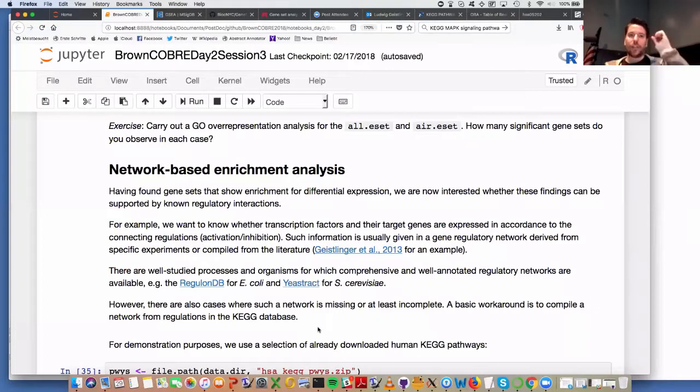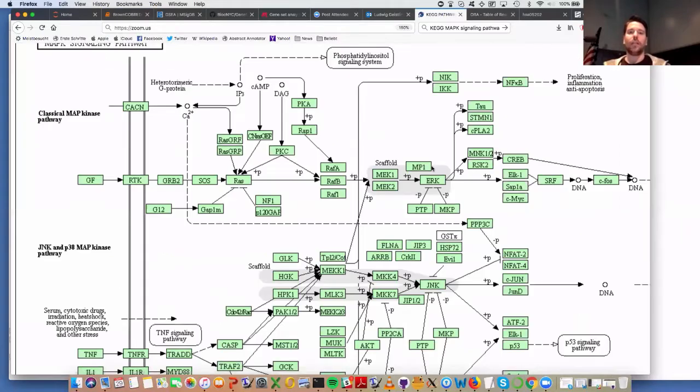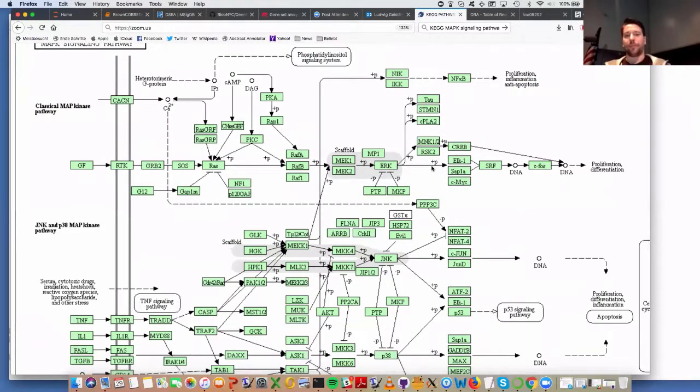So in gene sets, let's take another look at this little pathway map. When we do gene set enrichment analysis, we basically say we do not take into account all these little interactions which we have annotated in the pathway maps. I just say, I want to see, is there some differential expression? Yes or no. And this often gives me a lot of good conclusions and information, but I might do this a little bit more sophisticated.